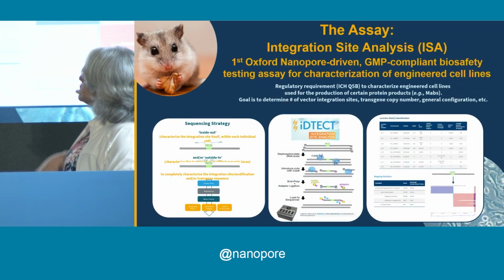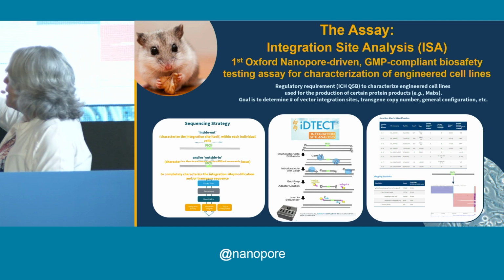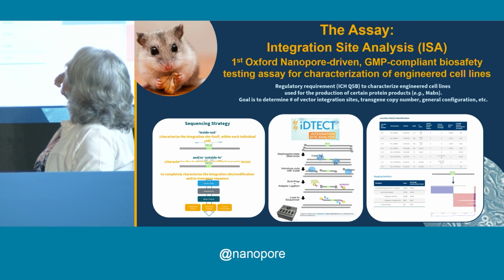Okay, so I'm going to talk specifically about an assay. You've already seen elements of this morning. And this is our integration site analysis.